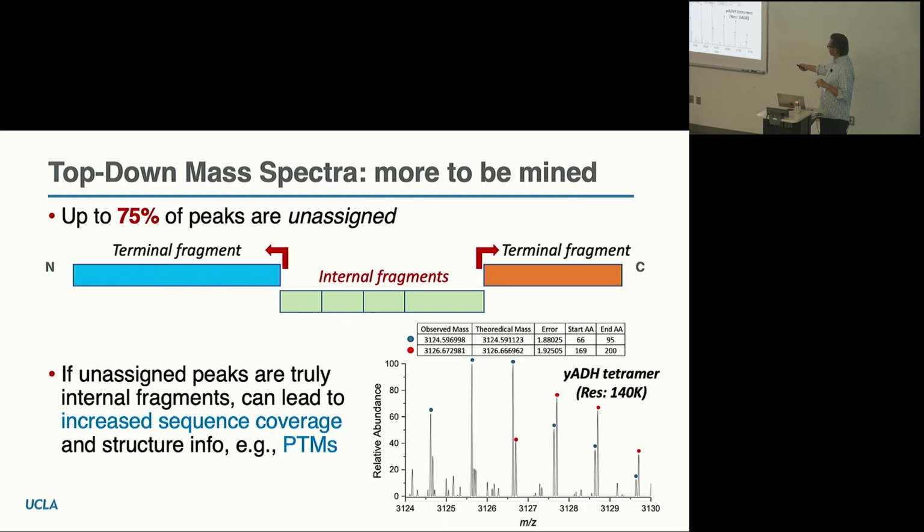Too many bullet points. These things here, these masses overlap with a lot of other possible assignments. And so if you did an MS3 experiment on these, then you can confirm what the sequences of these internal fragment ions are. So the Hawkinson laboratory proposed to do that. They showed a few examples at an ASMS talk last year and this year also. And we are on a paper with them to propose to do MS3 experiments on these.